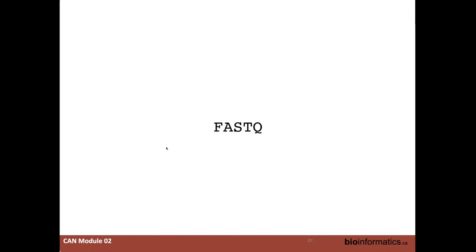I've got no ego. Okay, let's go on to a file format called FASTQ. This is one of those things where the concept really boils down to smaller segments of sequences that you want to do queries on. So you're going to get this particular length of sequence, and you're like, I don't know what this thing is, I don't know what to do with it. But it's really just storage, similar to the FASTA file format, just some sequence of some sort.